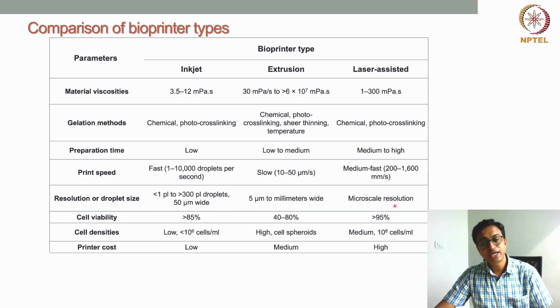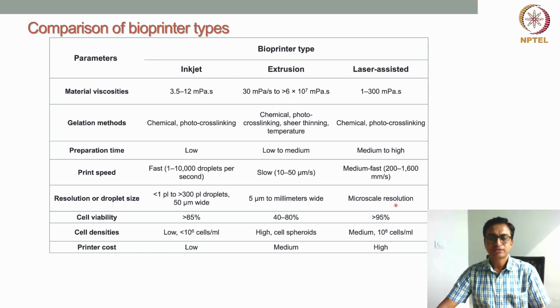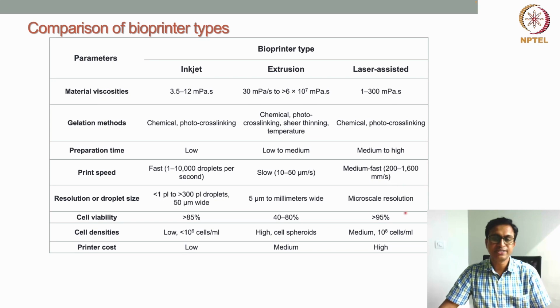Laser assisted, here also again the resolution is very high, very good, because here we can get a microscale resolution where we can generate droplets containing single cells. So that much fine resolution can be made. So that's why this laser assisted bioprinting technique, the resolution is very good.